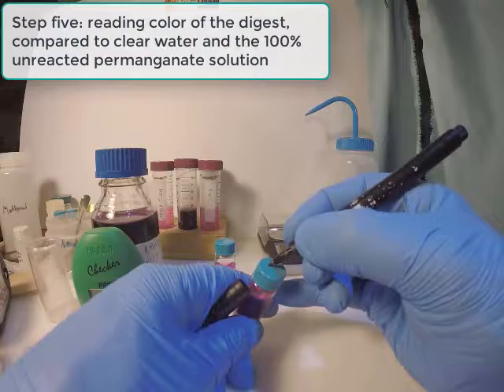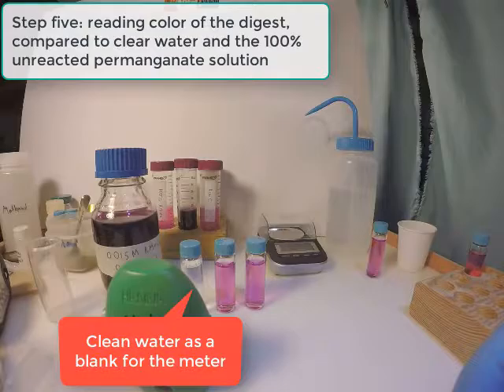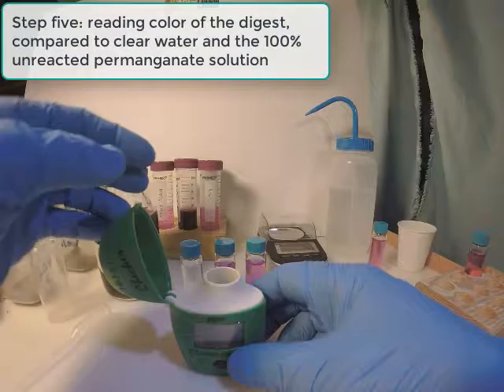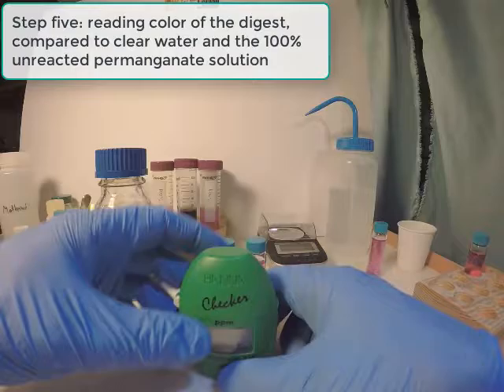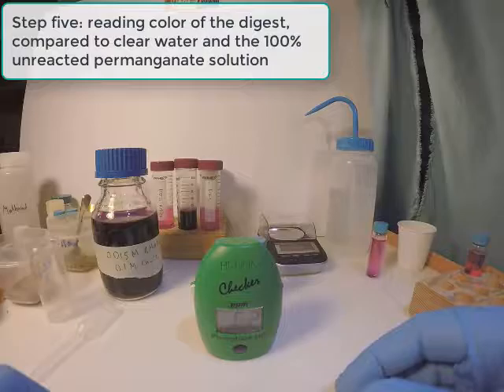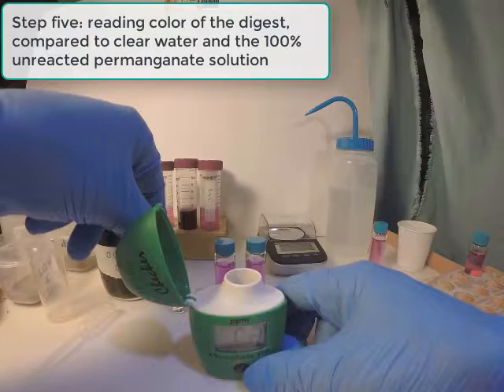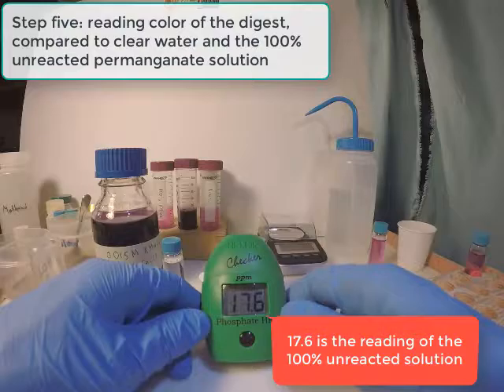We can label the tubes on the lids so we're not obscuring the vials with marker. To start the measurement, we first put in the blank — just clean water — and turn on the meter by pressing the button once. It will say C1; then we press the button again and wait. It will then say C2 — that's when we put in our sample or the 100% solution. First the 100%. The reading of the 100% is 17.6.